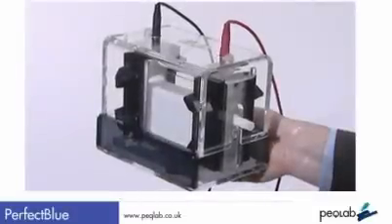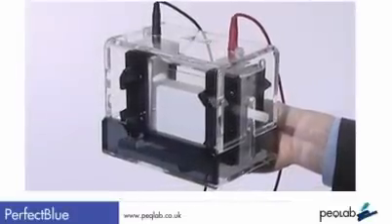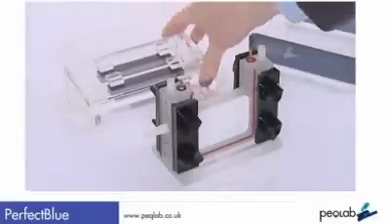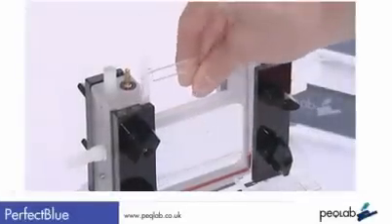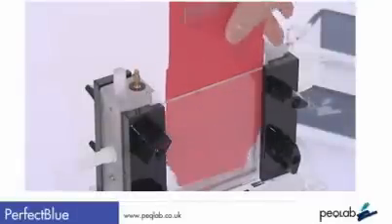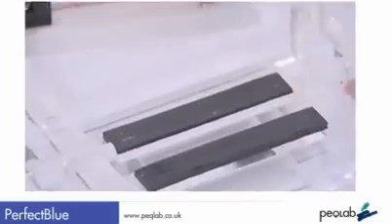Before we have a look at the system, here's how you set them up — you can time me if you want. Invert the casting base, place the chamber on with the glass slides. The spacer placer comes in useful. Spin over the casting base and tighten the gaskets, and you're ready to pour.